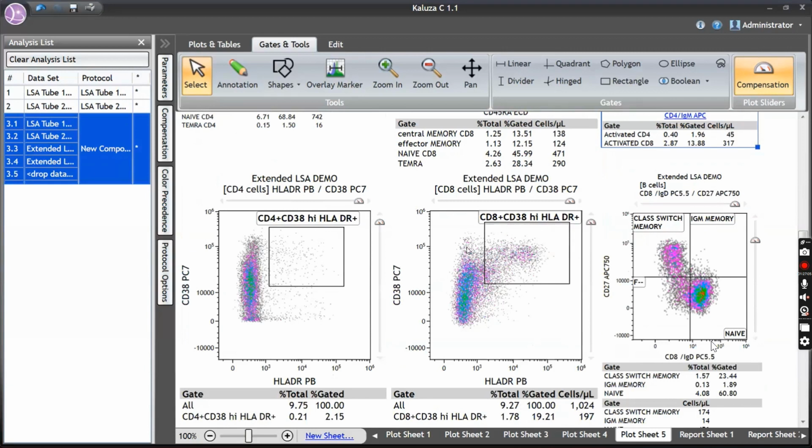And then again, this is for HLH, because cytotoxic T cells with co-expression of CD38 and HLA-DR greater than 7% is indicative of HLH in cases where biomarkers are present. That is high ferritin, high triglyceride, low fibrinogen. When that is present and when you have CD8 positive T cells co-expressing CD38 and HLA-DR greater than 7%, then it is suggestive of HLH.